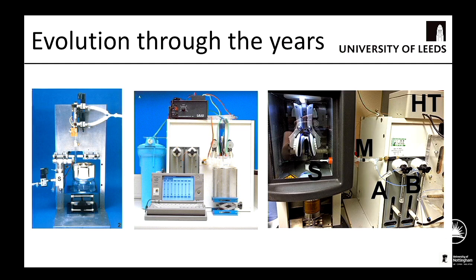So the first thing to say is that this has not been a quick process. And actually, in Leeds, there's been a history of time-resolved studies, both in negative stain and cryo-EM, for a number of years now. Howard White, working with John Trinick, initiated some of this, and these are some of their old systems. When I joined Leeds in around 2006, I started to use this system for a while, primarily making negative stain grids as well as cryo grids. And then with Howard White in around 2010, we started to make this new machine.